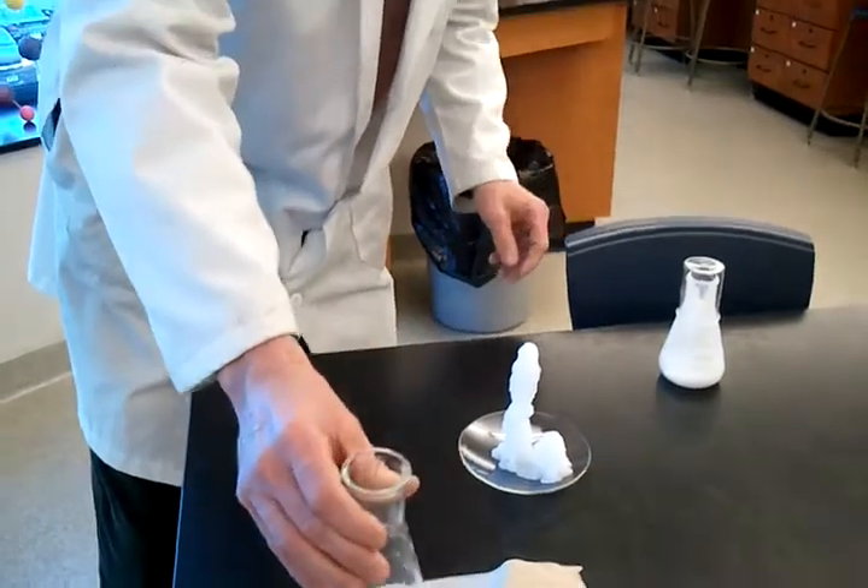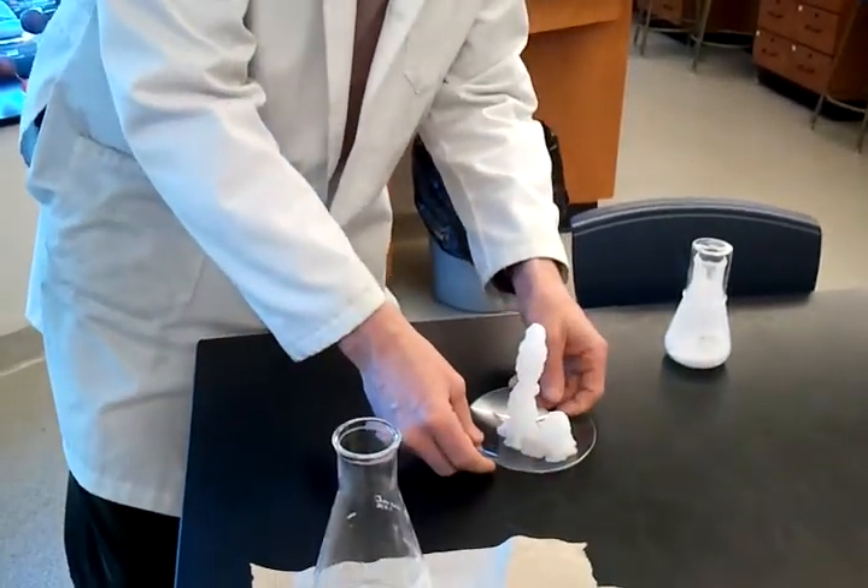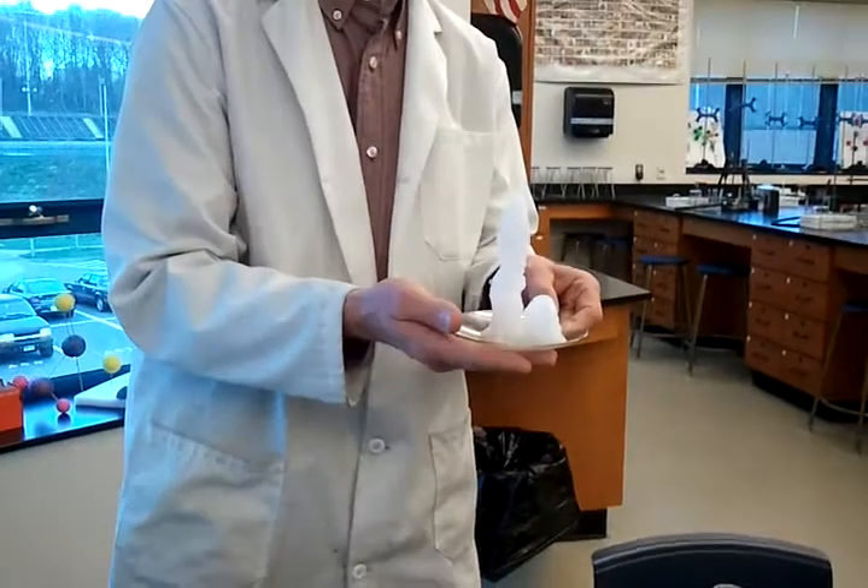Now, the interesting thing is, you may think this is really, really cold, because it is frozen, but if you feel the bottom of this, it is very, very hot, which means this reaction is exothermic.